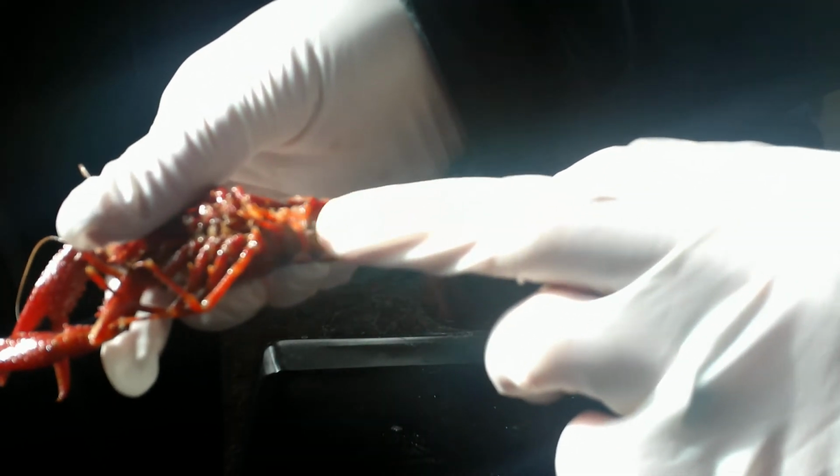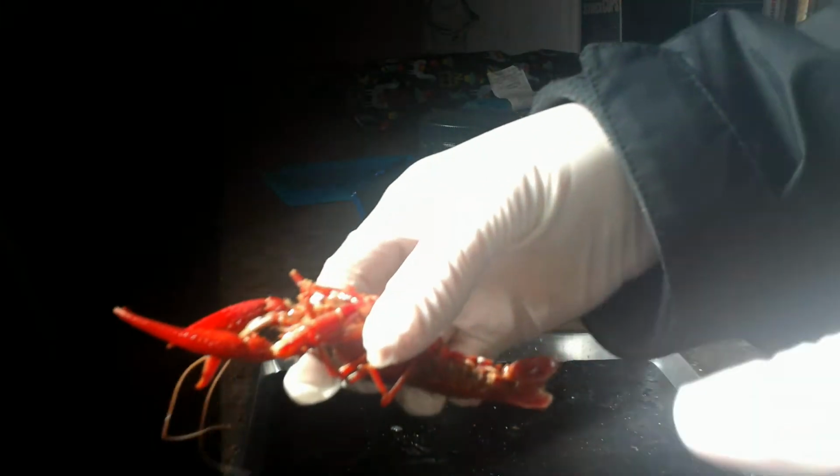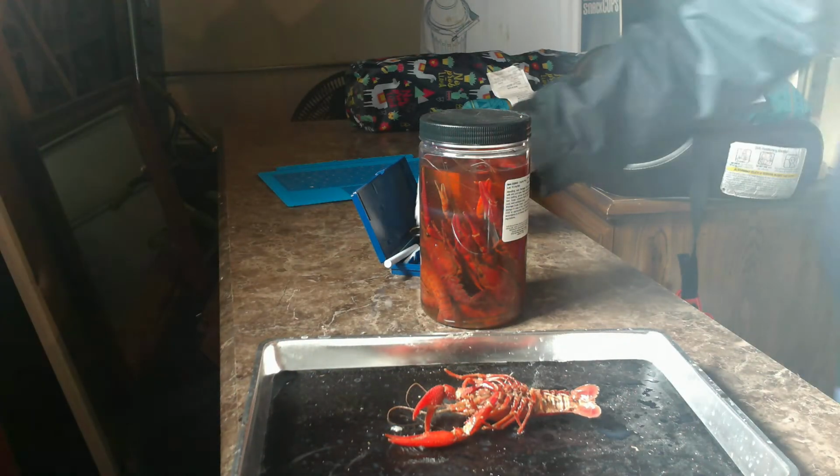Okay, then you should be able to see a dark line all the way down here leading to a pole. So this is actually the intestines, and then this is the anus back here. And then we have our uropod, or our tail, all the way here towards the back, okay? So that's just kind of like external anatomy. We have our chitinous shell here, so we have an exoskeleton as well. Okay, so I think that pretty much covers everything externally. We'll go ahead and get to internal anatomy here.